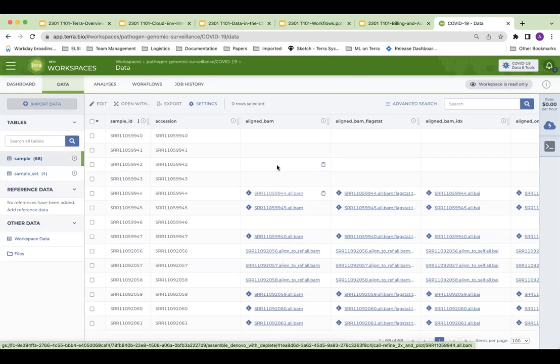If you don't want them in the same table, you can create separate tables, each with a group of samples in it. You don't have to name them sample; you could call them sample 1, sample 2. You could have different sample tables. I didn't know that. Okay. It's kind of new. Well, new-ish.